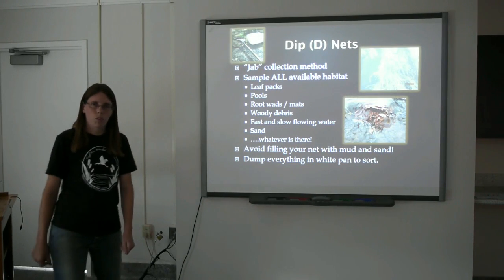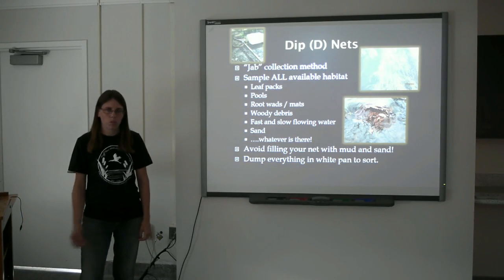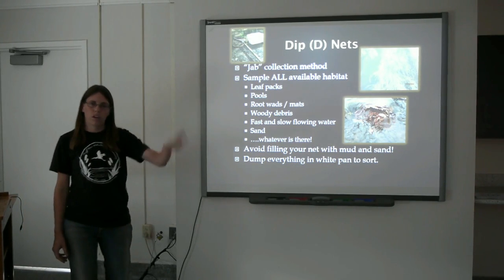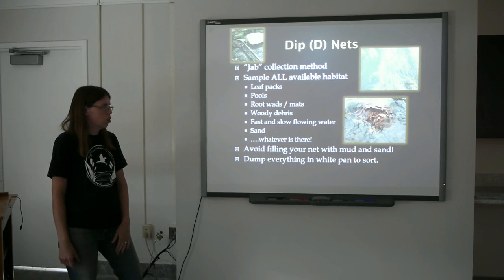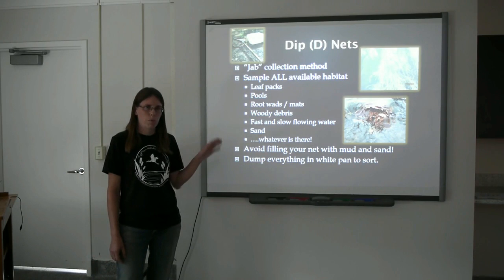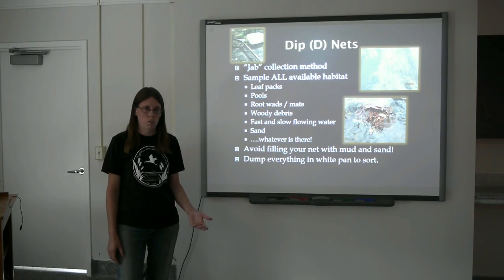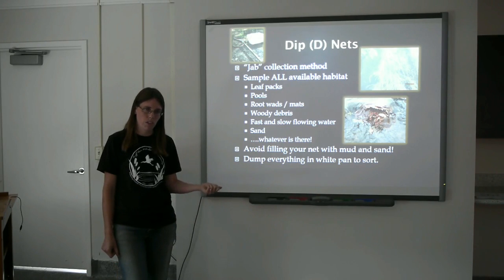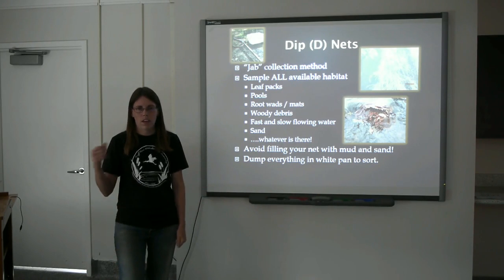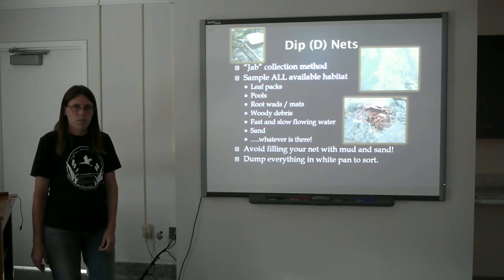Some of the habitats you would be sampling with a dip net include leaf packs, pools, root mats, might be the overhanging vegetation on the side of the stream, woody debris, and you want to sample these habitats in both fast and slow moving water. There's a lot of different species that would live in a fast moving root mat than a slow moving root mat. Also sand, any other habitat that's there.